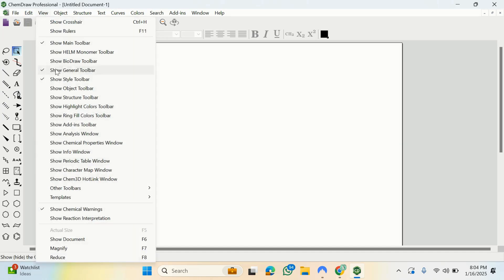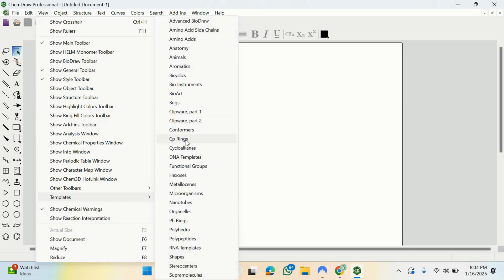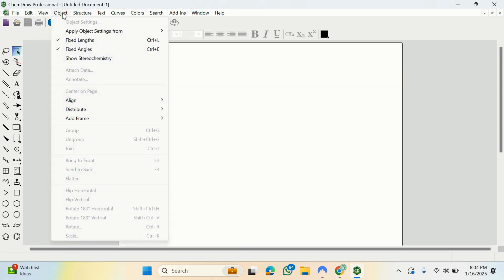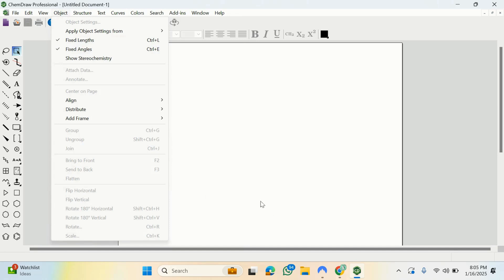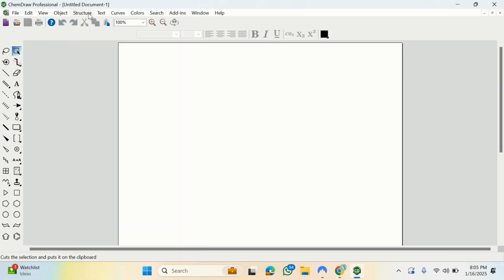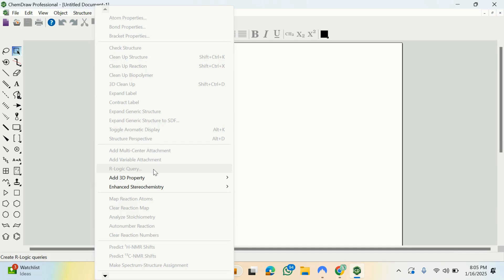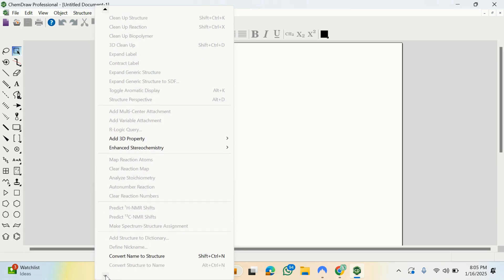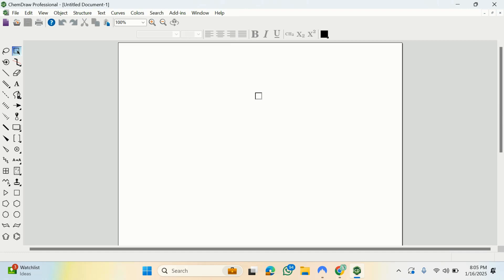You have your view — that's where I just highlighted that. You can highlight as many options, including your templates, which we're going to see soon. Then we move to the objects. Objects is where you must have drawn something here, or you're working on a chart or a graphical abstract. You have a lot of things here that you can actually work on. You also have your structure here, which you certainly make use of — especially this particular option. Your structure button, you need that as a computational biologist because you'll certainly be doing a lot with structures, drawings, estimation, predictions, and calculations. You have your text, your color, and all that.